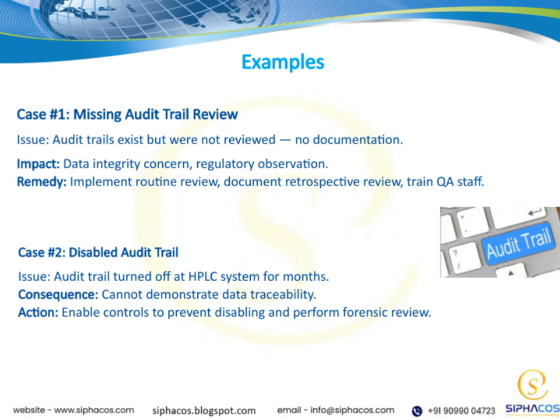Here, the audit trails actually exist, but they were not reviewed regularly, and there was no documentation of any review process. This raises concerns about data integrity because without proper review, potential issues might go unnoticed, and it could lead to regulatory observations. The remedy for this situation is to implement a routine review process for audit trails.